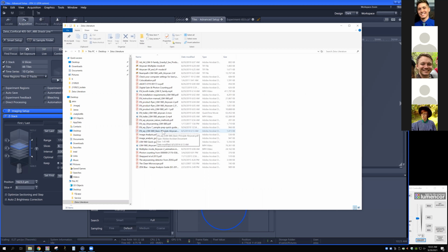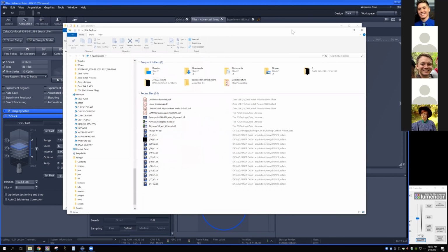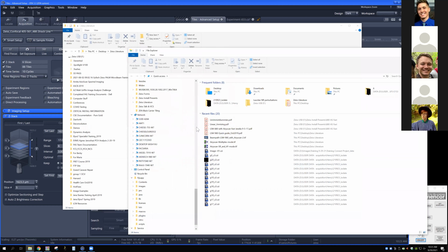And basically, this kind of flexibility in terms of the application is exactly the reason why I exist. So if you're looking at the different focus strategies that we've talked about, if you're trying to implement them and if they're not working, that's exactly the time to reach out to me. Even before you spend any time trying to do that, it's a great opportunity to reach out to me, say, this is the experiment that I want to do. And hopefully in a heartbeat, I can tell you what kind of focus strategy is going to work best for that particular workflow. All right.